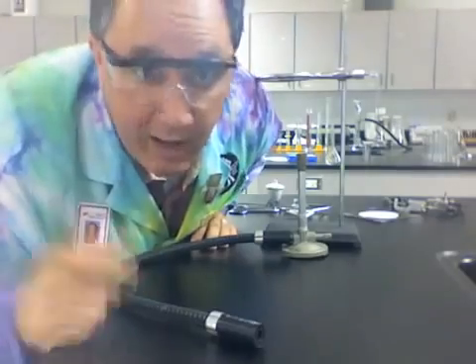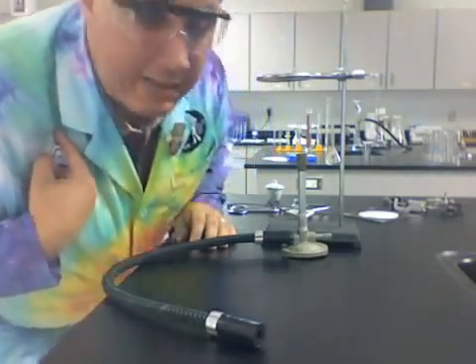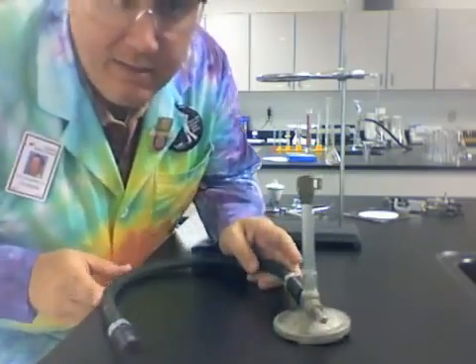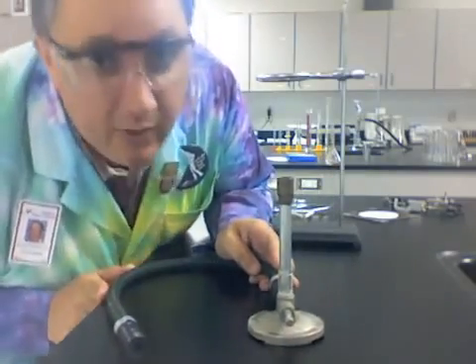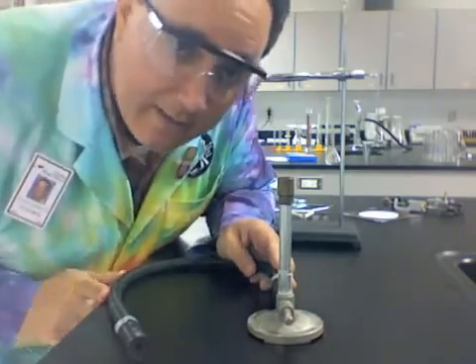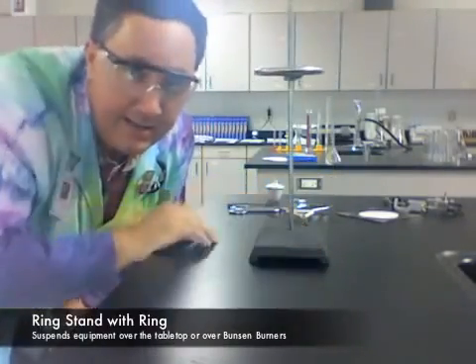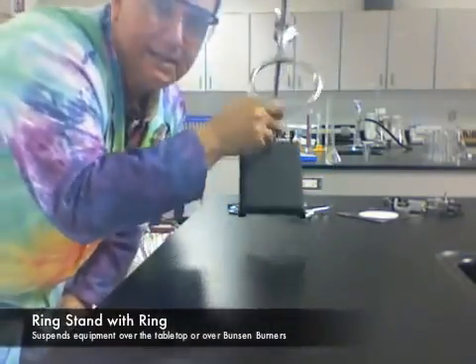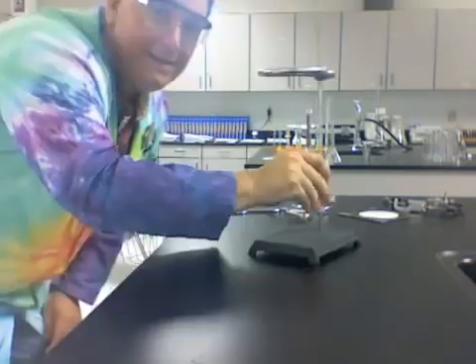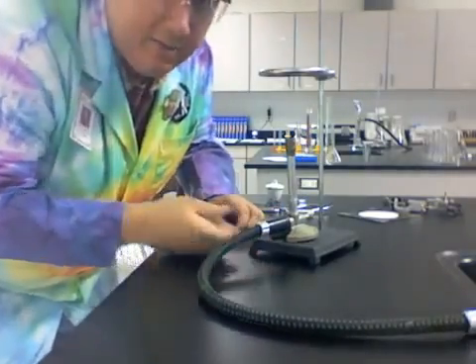I'm ready for lab. I have my safety goggles and I have my lab coat on. It's time to use the Bunsen burner. This is a little guy that you're going to get very familiar with. Along with the Bunsen burner, we're going to use some other equipment. First of all, it's the ring stand. It's simply a stand with, ta-da, a ring. The ring stand will be used over the Bunsen burner.